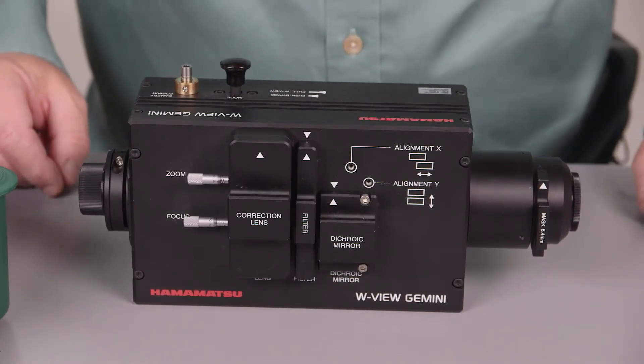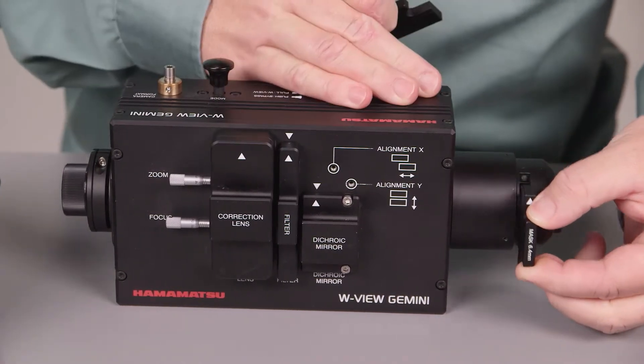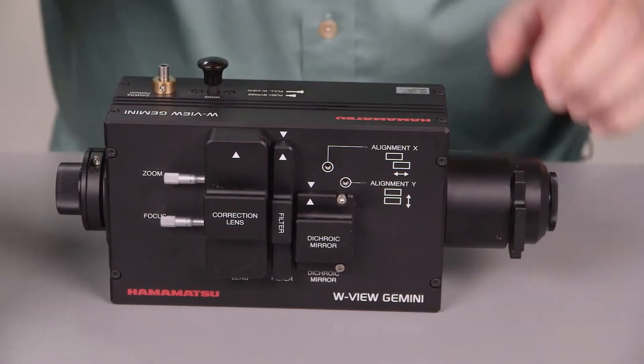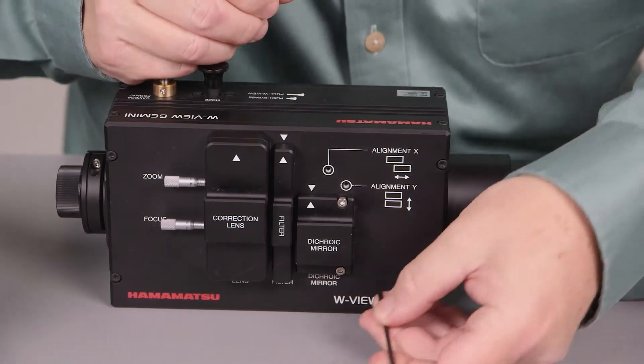To put it in Bypass Mode, first you remove the aperture mask. You're going to replace it with a dust plug. Next, you're going to remove the dichroic block.